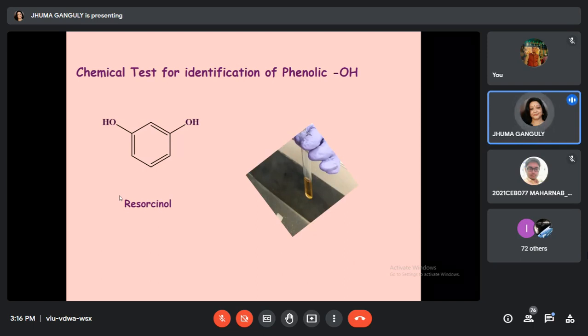These are not soluble in water. For carboxylic acid you can take an aqueous solution, but you can also take an ethanol solution, no problem, because we put solid sodium bicarbonate and the reaction at the surface releases carbon dioxide.